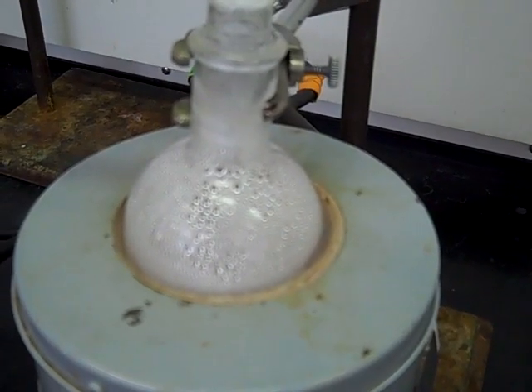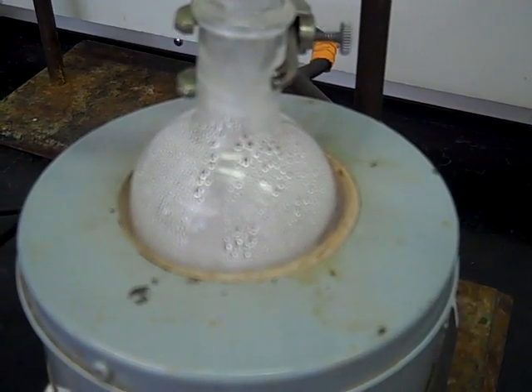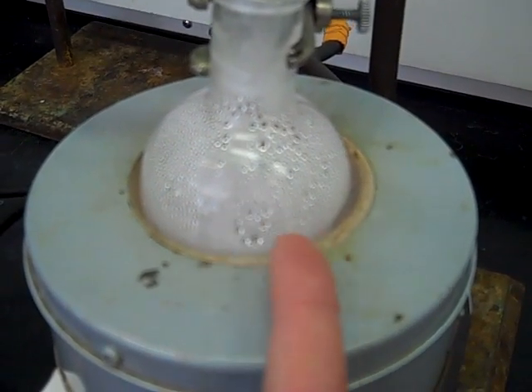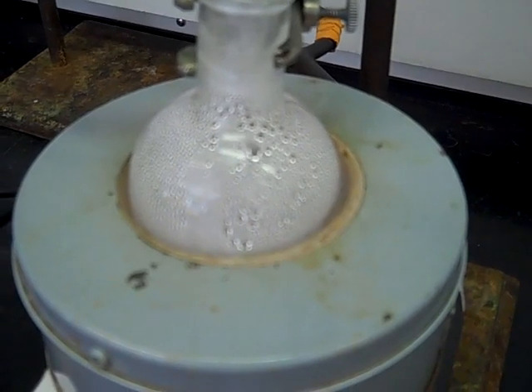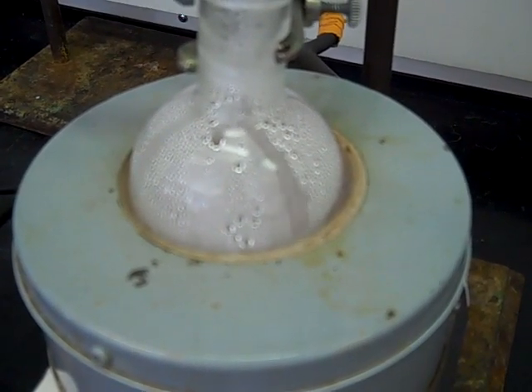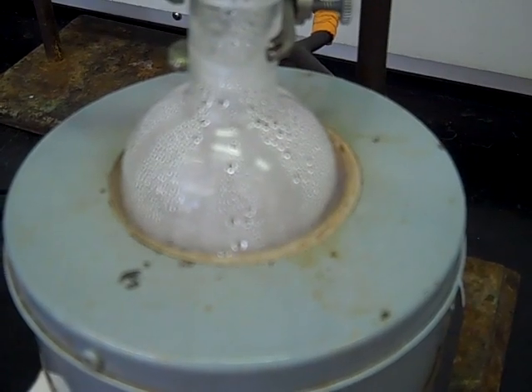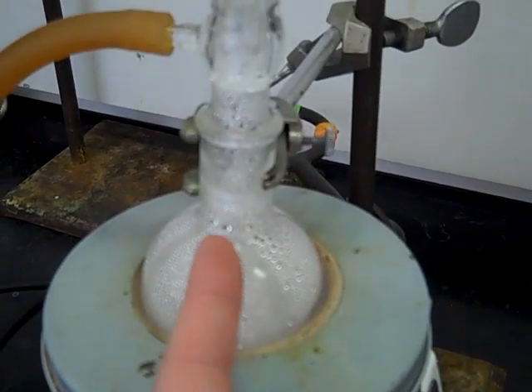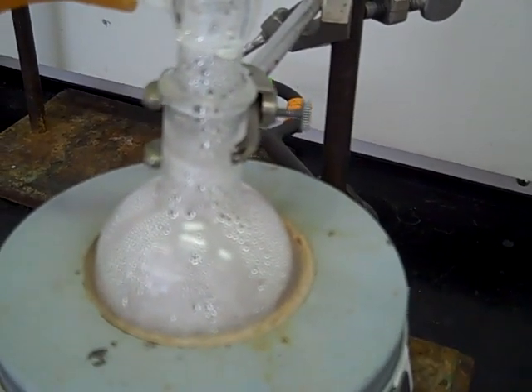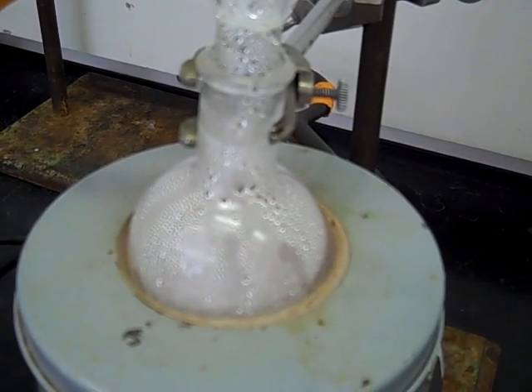The reflux process doesn't actually start until your solution starts to boil. Once the solvent starts to boil — as you can see it is now — that's the reflux. So if you're supposed to reflux for 30 minutes, this is the start time when it begins to boil like that. The heat being delivered to your reaction is controlled by the boiling point of the solvent. In this case it's water or an aqueous solution, and that controls the heat delivered to your reaction. As the solvent vaporizes, it comes up into the water-cooled condenser and then condenses right back down into your flask to repeat the process. This is known as reflux — a great way of controlling reaction temperature based on the boiling point of the solvent you choose.